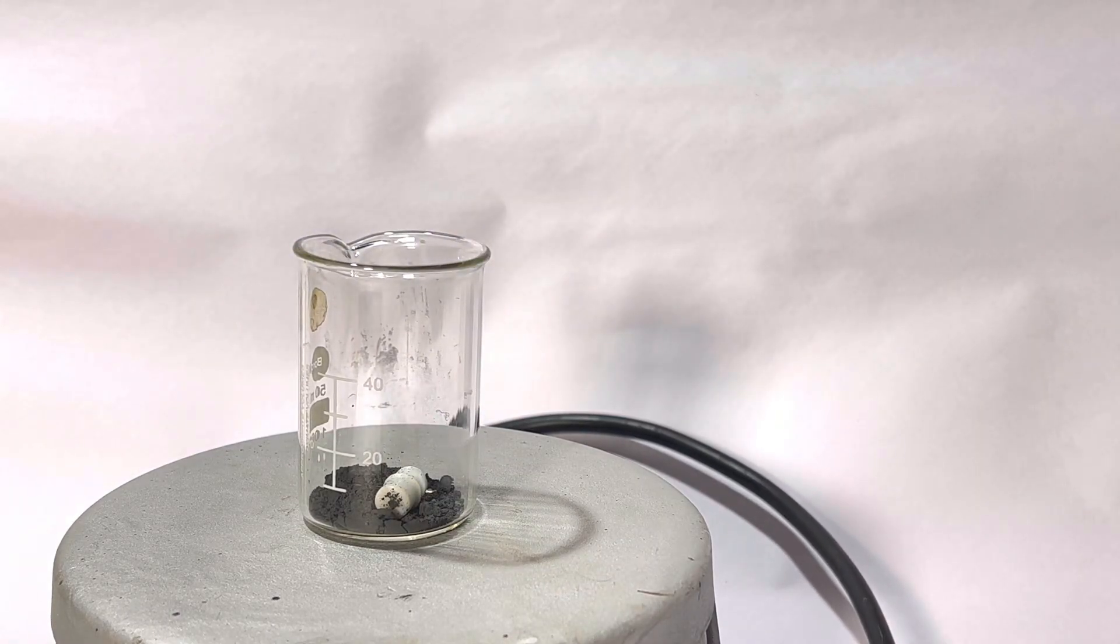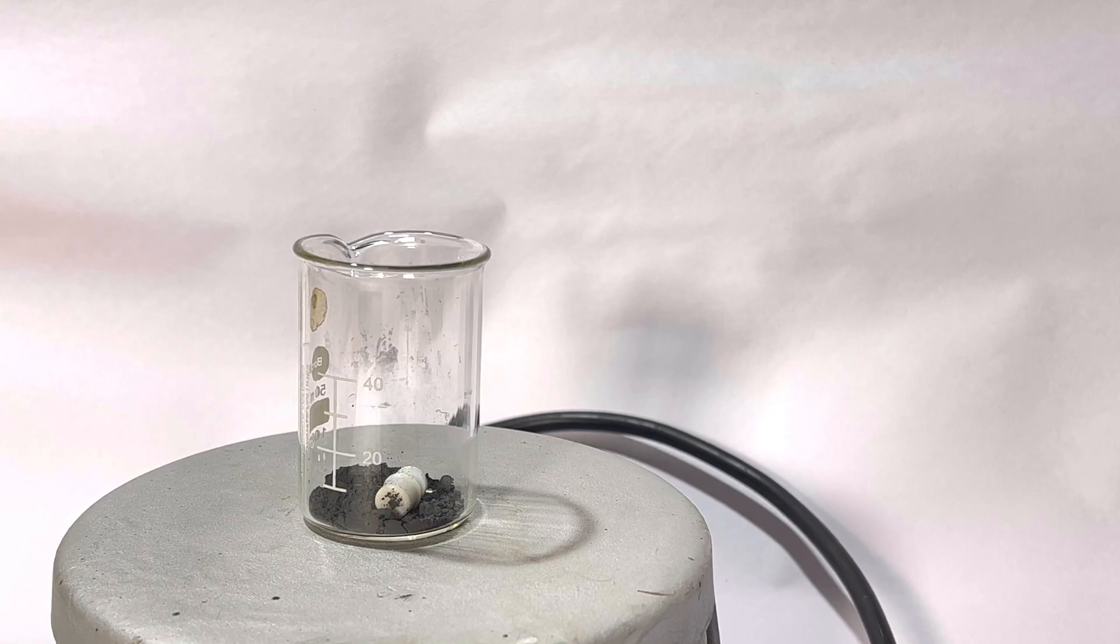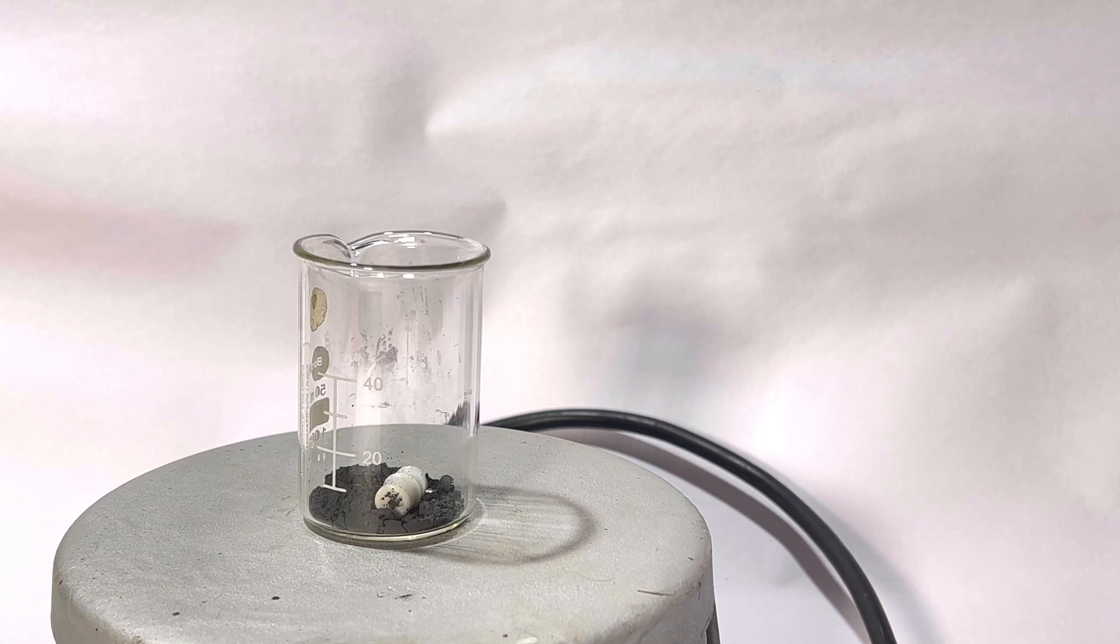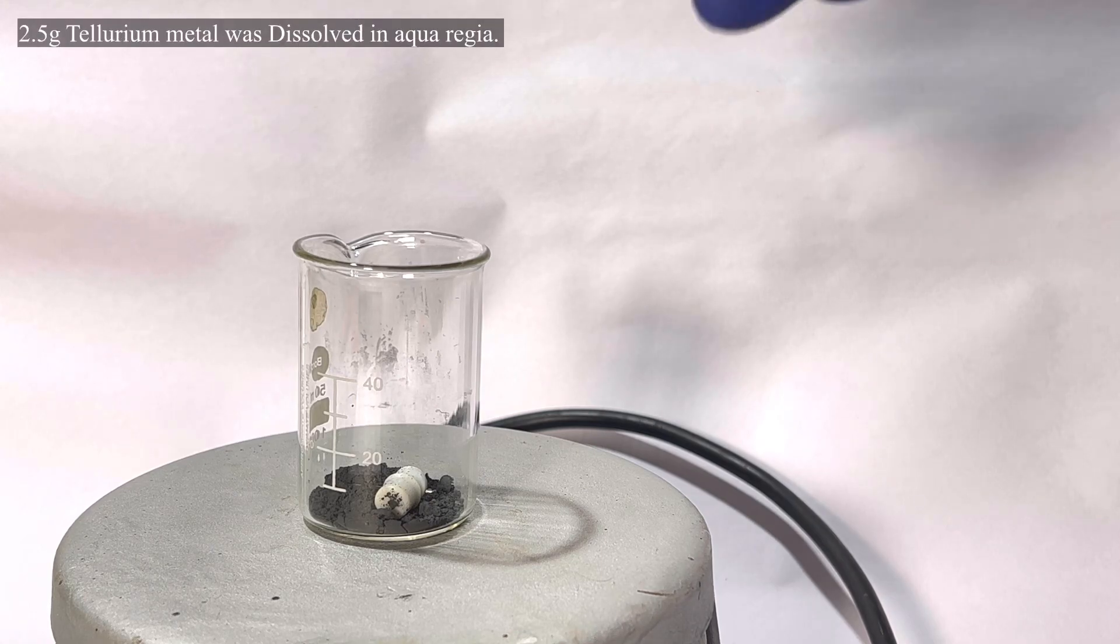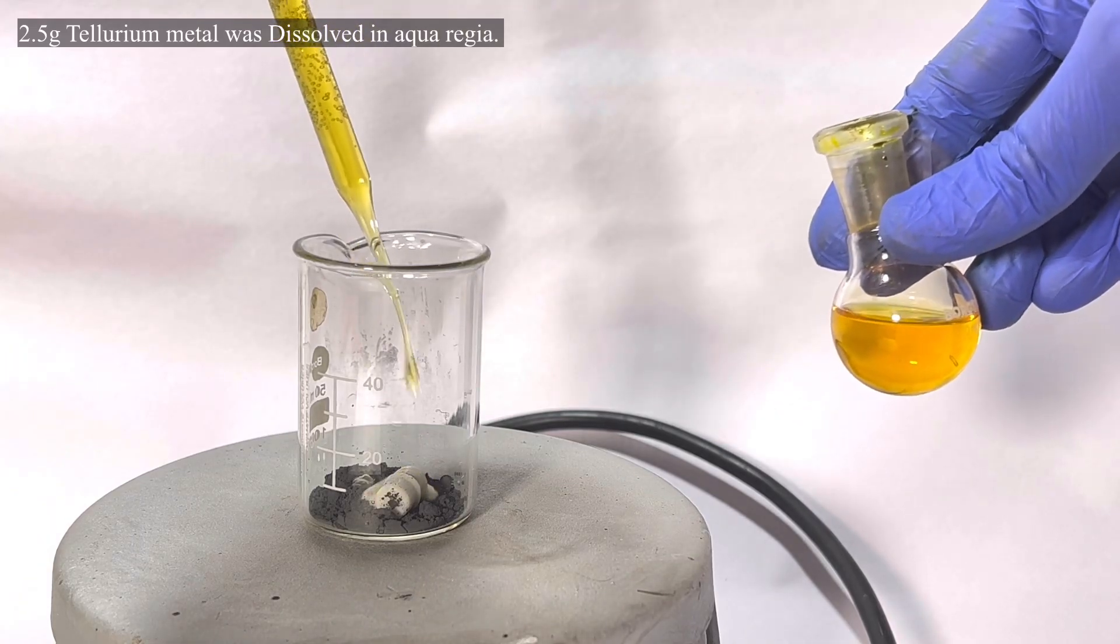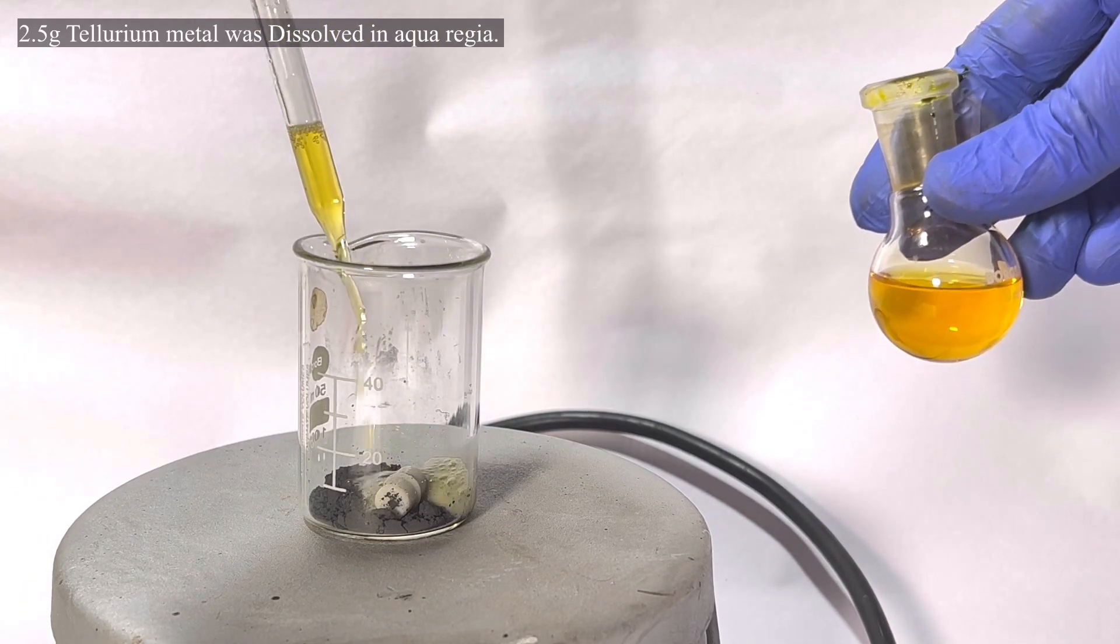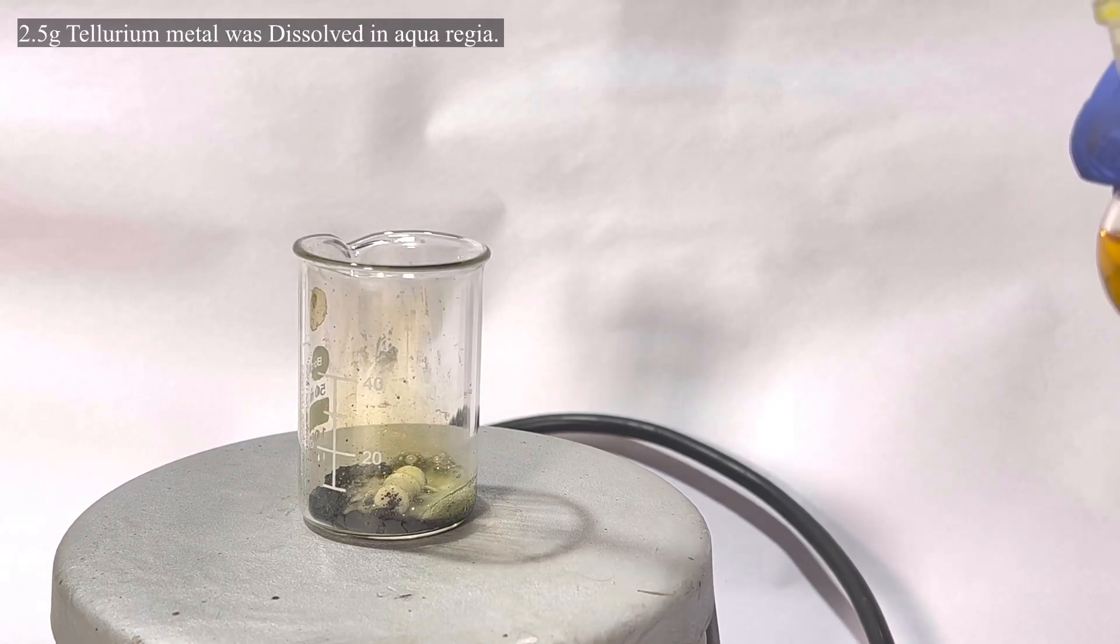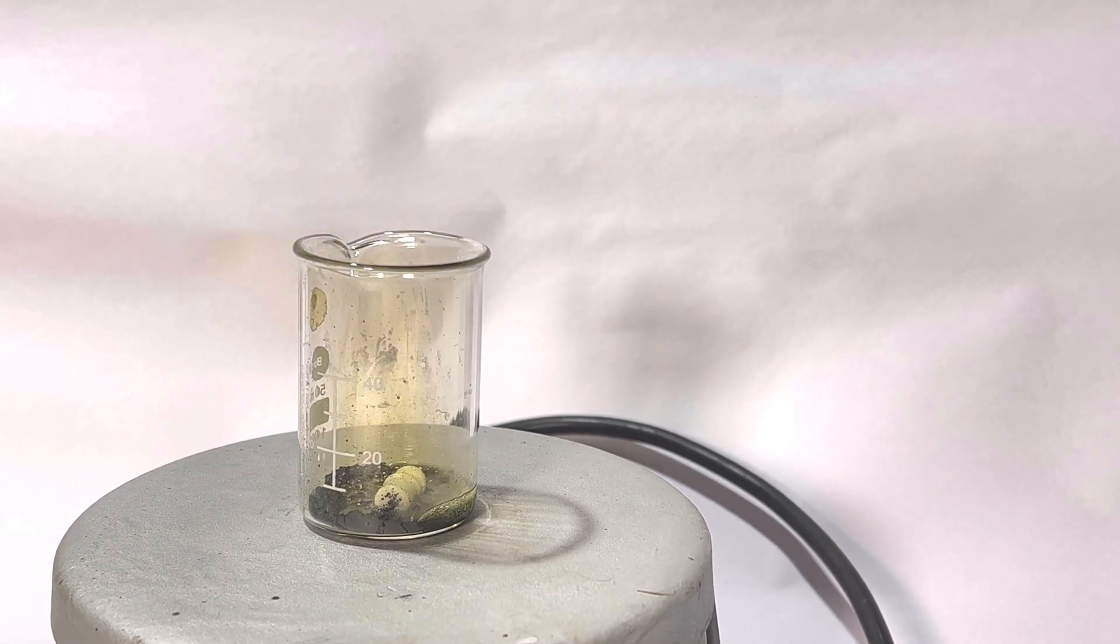Here you can see me using a small 25 milliliter beaker. This was a mistake on my part and I recommend you guys use a bigger beaker or an Erlenmeyer flask. Next, add the aqua regia to the beaker. Immediately you see the reaction commencing with the evolution of brown fumes of nitrogen dioxide.